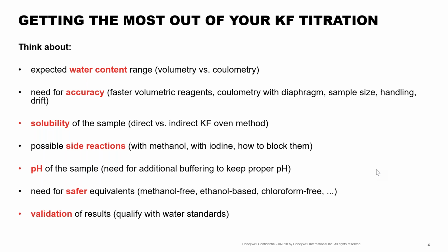Now, we learned that it's a quantitative water determination method. That means that it's going to give us a water content number. We're going to inject the sample, it's going to give us a number, but we need to be a little bit careful when interpreting our Karl Fischer results. That result may not actually be accurate depending on our sample's properties. We may need to think about oil samples, for example. We may need to quantify the water content in an oil sample, and that's not soluble in methanol by itself.